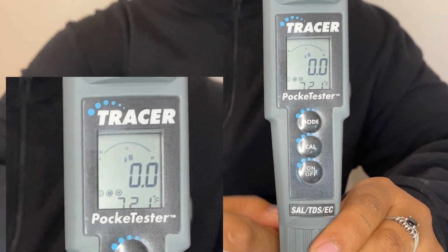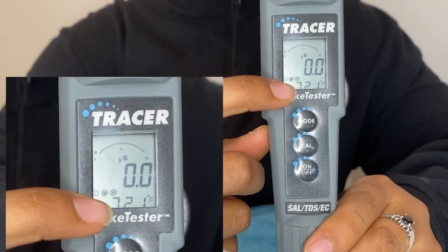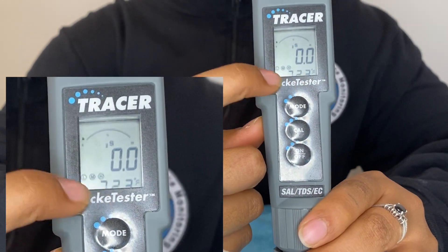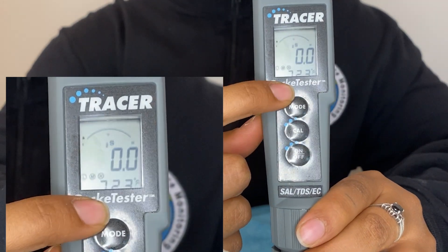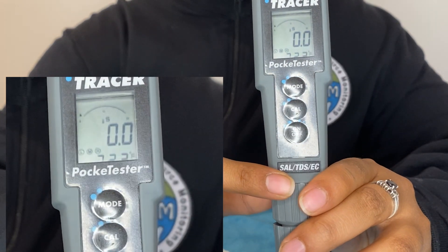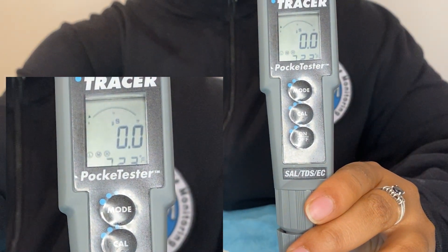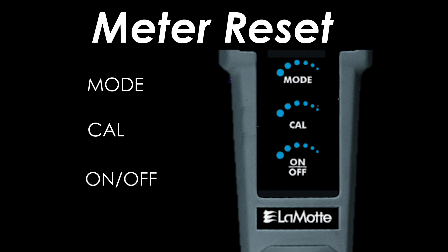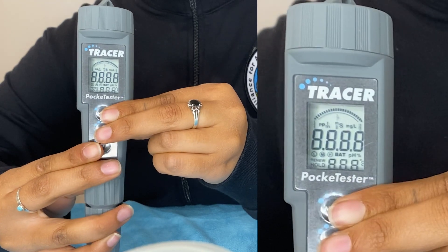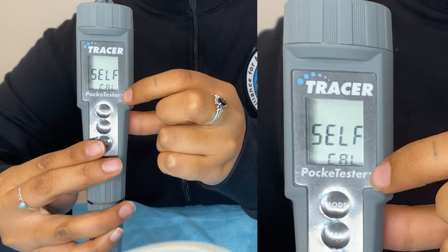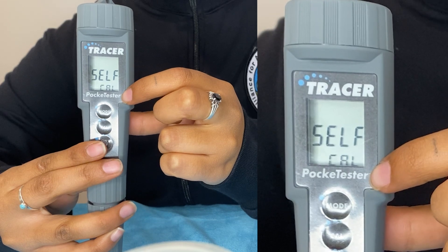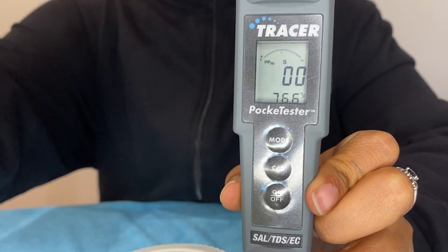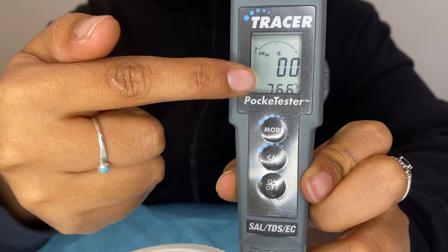On this meter, you can see three letters circled close to the bottom of the screen. To get rid of these letters and recalibrate your meter, you want to reset the meter. To reset your meter, use two fingers to hold the mode and CAL buttons, and then quickly press the on/off button. Your meter will then turn on and display 'default,' 'reset,' and then turn to its home screen. After this, those symbols should be gone and we can calibrate our meter from the start.